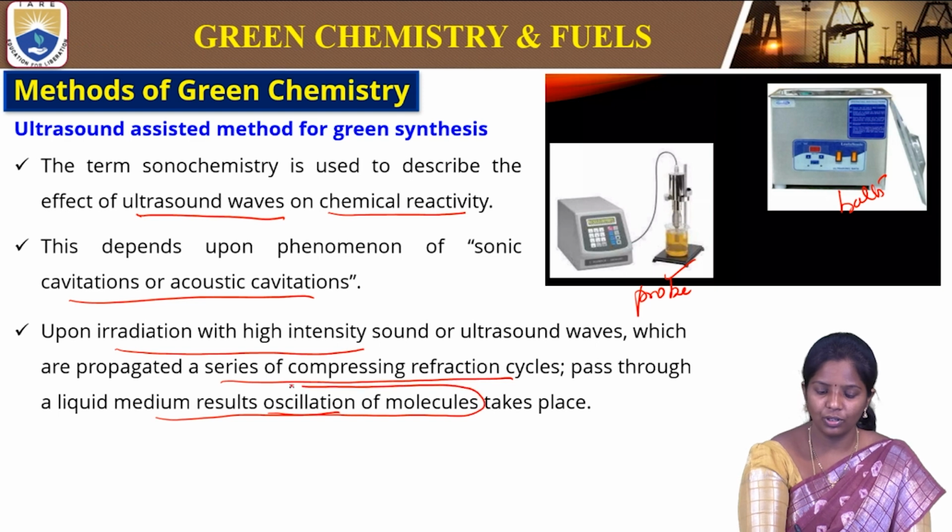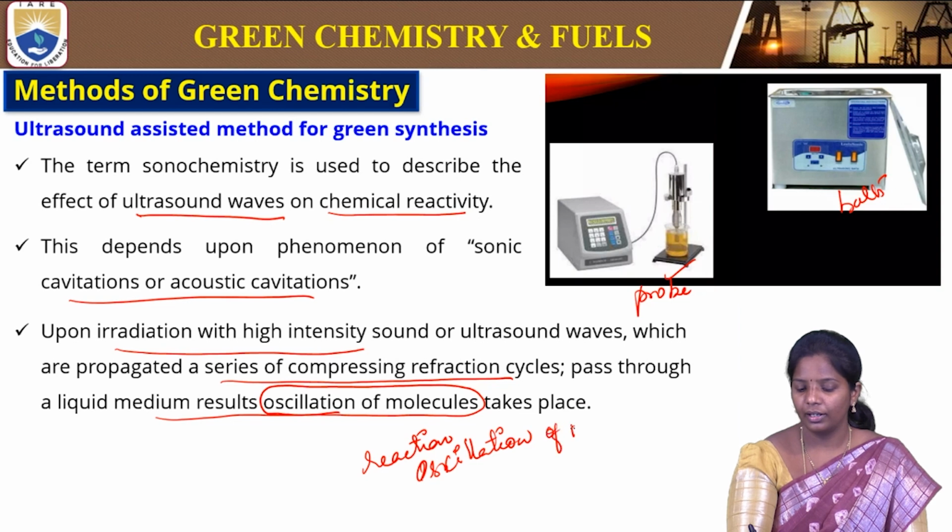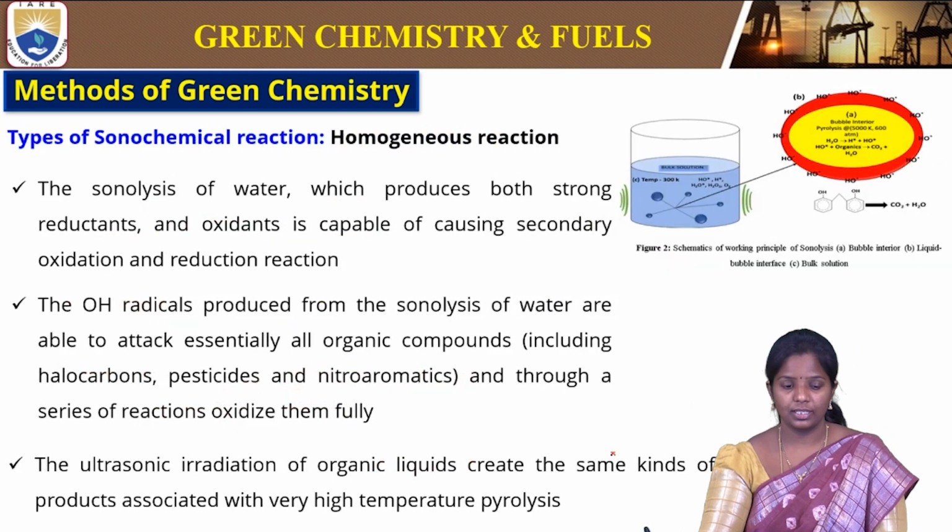So this is very important. The reaction will take place because of oscillation of molecules present in solution, or the reactants. Molecules here is nothing but the reactants. So this will help in forming products.